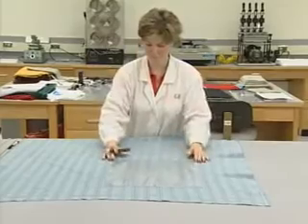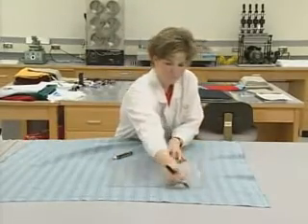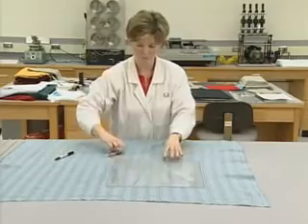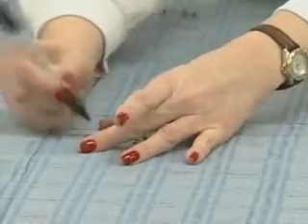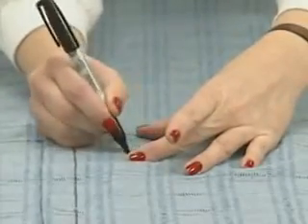The subsequent 2 specimens must be located so that different warp and filling yarns in wovens or different courses and wales in knits are included in the test. If enough fabric is available, then the specimen should be laid out in a diagonal across the width and length of the fabric. If not enough fabric is available, then an L-shaped pattern should be used.